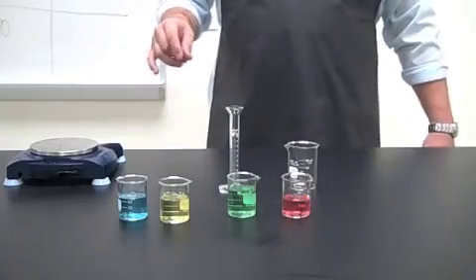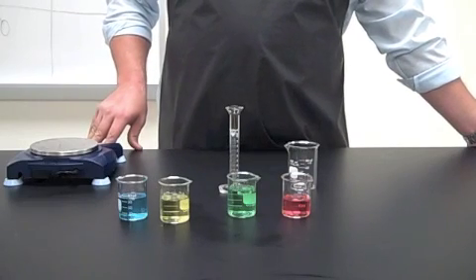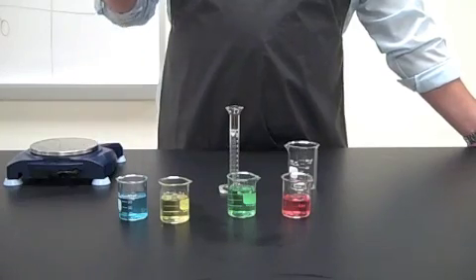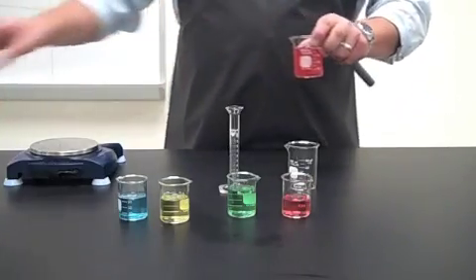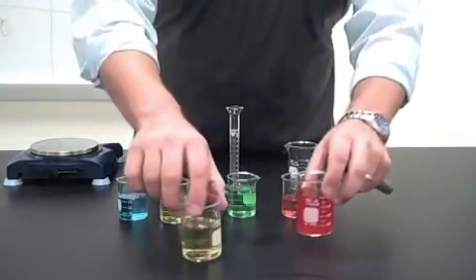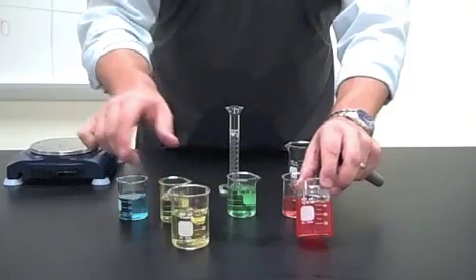And what we're going to use these for, these are going to give us a reference sample. And it's going to give us a graph that we will use later to help us determine the % of sugar in 2 different beverages. The first is going to be apple juice. And then we have Hawaiian punch.